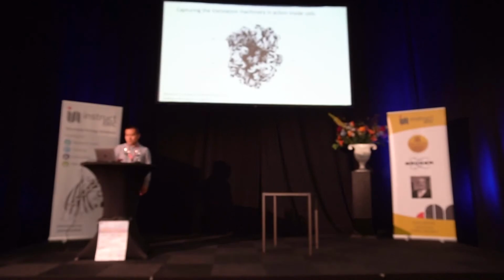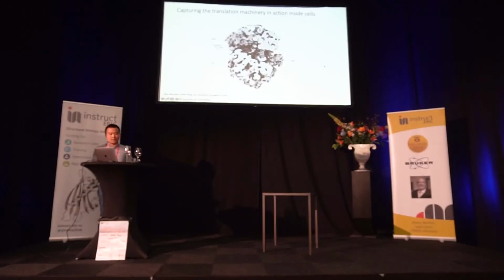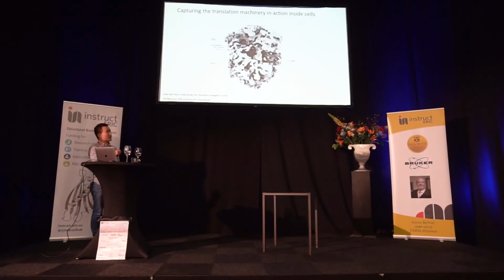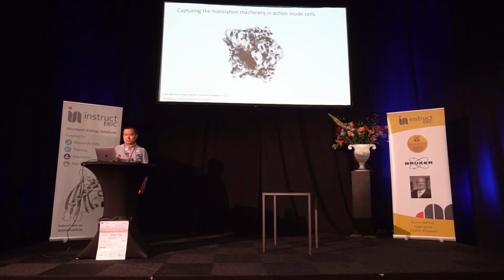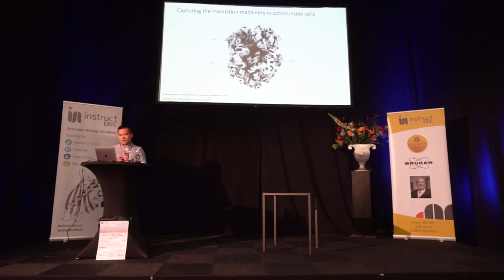And this movie I show is actually to try to place these elongating ribosomes in a sequential order, and you can see the continuous movement of elongation factors and also tRNAs through the A, P, and E sites. And together with these dynamics of factors, we also see the rocking and also rotations of the small ribosomal subunit. And at this resolution, it is possible to derive pseudo-atomic models.